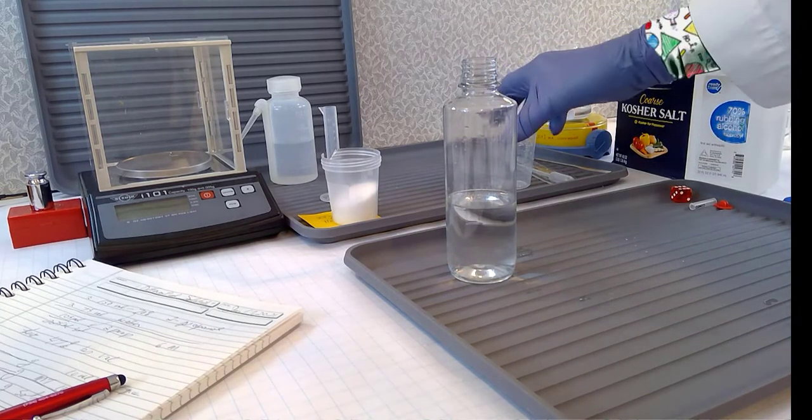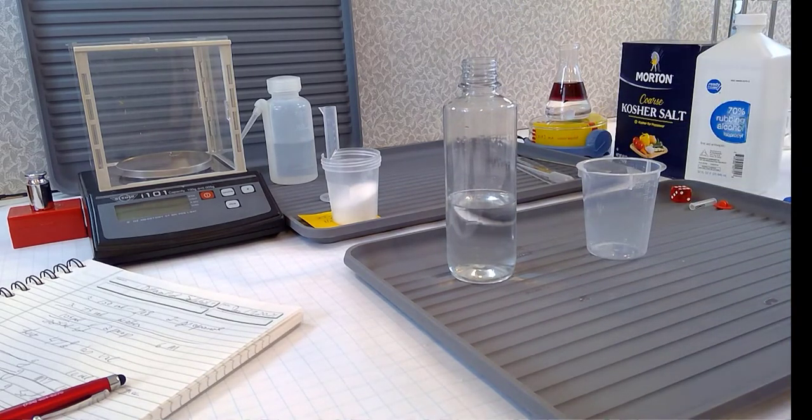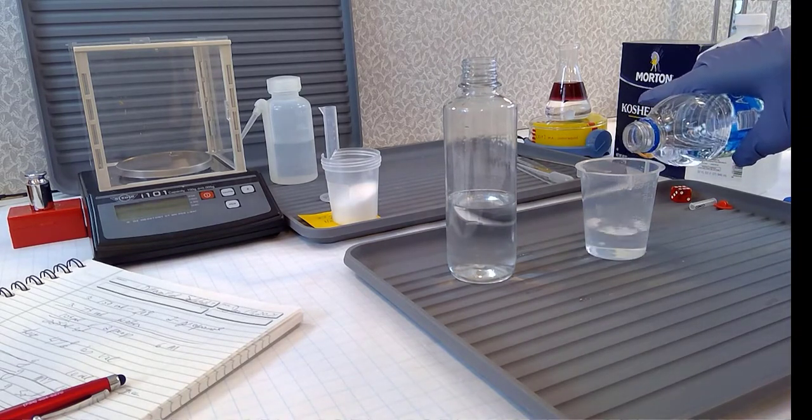Now, I'm going to dilute this a little bit for this experiment. I'm going to put in about 50 mLs of water. So again, I'm going to approximate, 40.